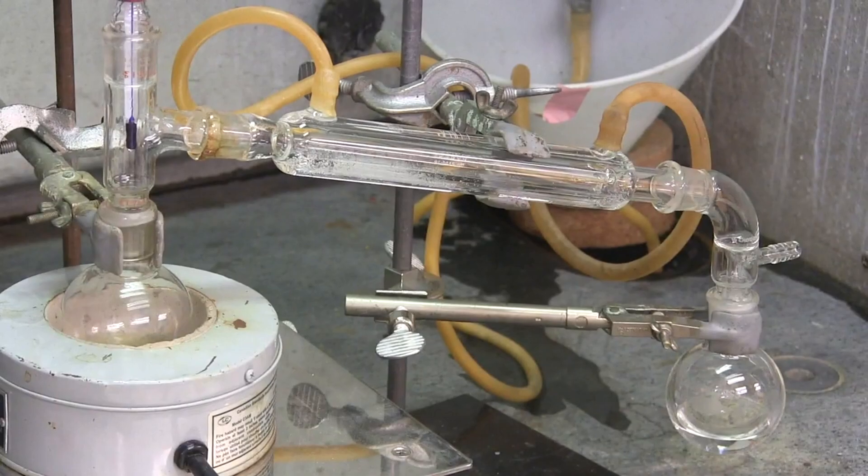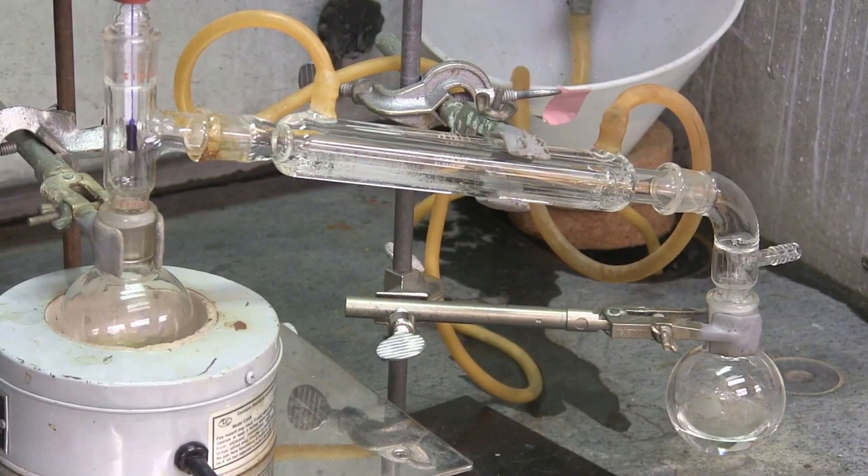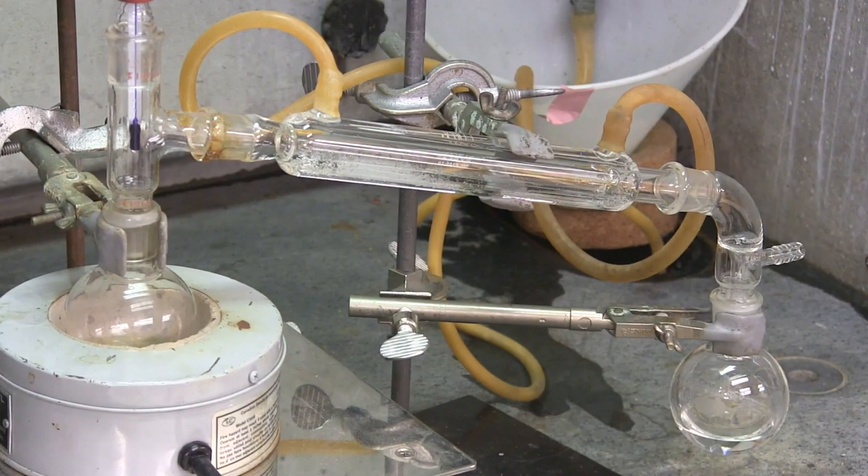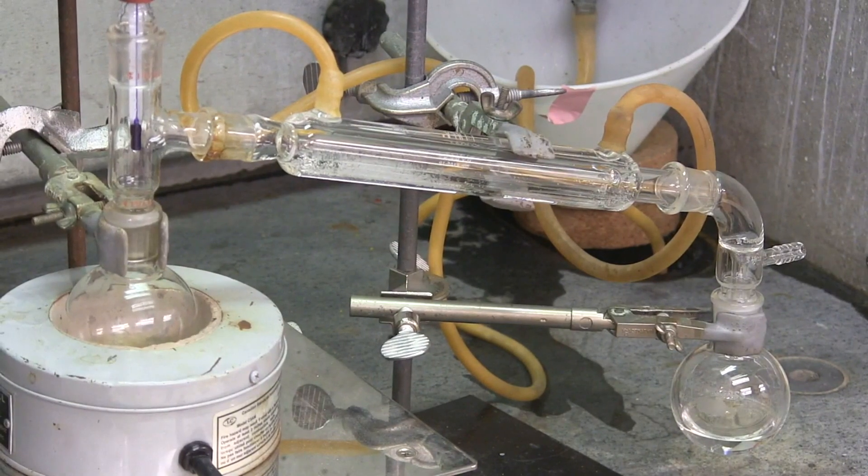Here we can see a simple distillation in progress. Note that the thermometer bulb is placed just under the adapter joint, such that the reading is an accurate temperature of the hot vapor inside of the apparatus.